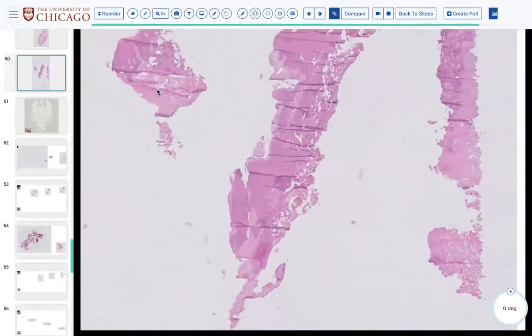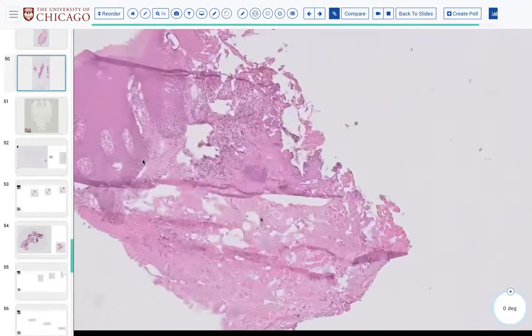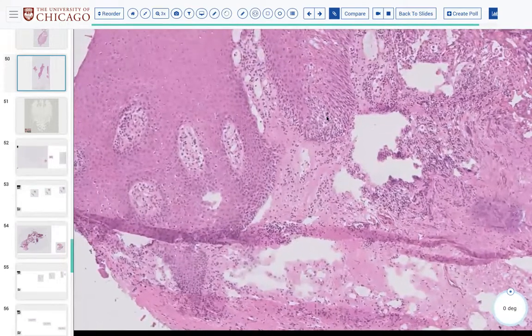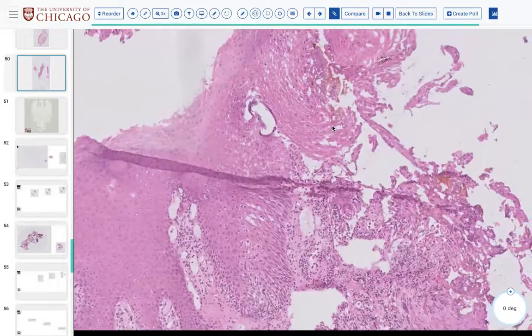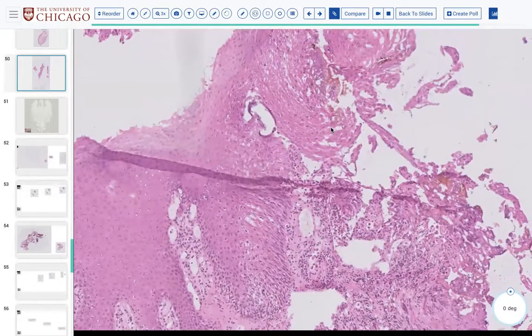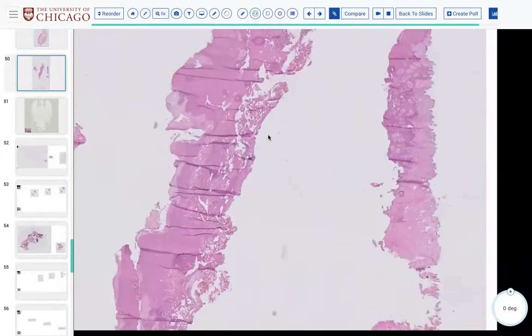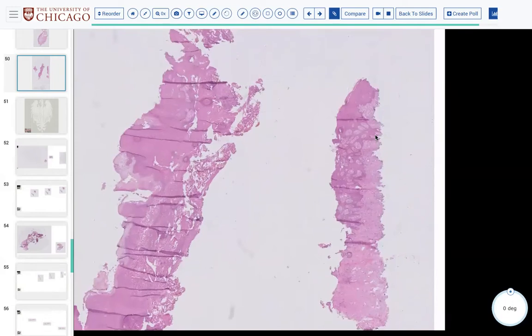Good. In this slide there are 3 tissues, so we can put these 3 tissues in one chuck while doing frozen, as long as they're from the same container. Yeah. Obviously don't ever put tissue from different specimens in the same chuck. But if you have multiple fragments, or if you have a really long strip that you segment into parts, yes, you can freeze them in one chuck. It mostly is a matter of your comfort level with embedding and cutting multiple pieces of tissue. But it's definitely allowed.